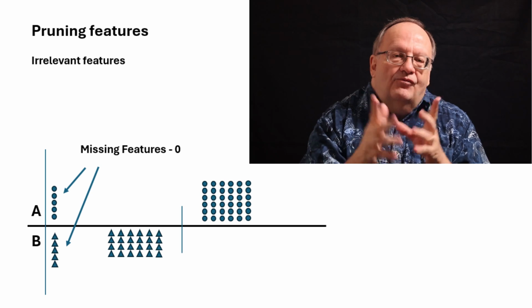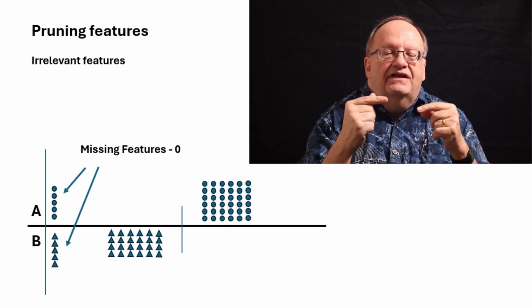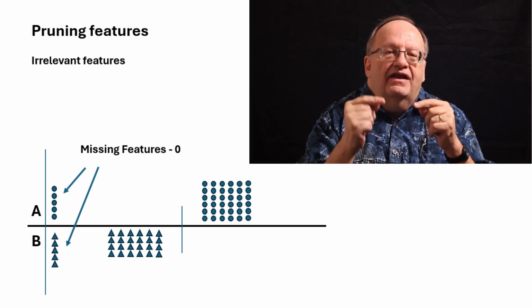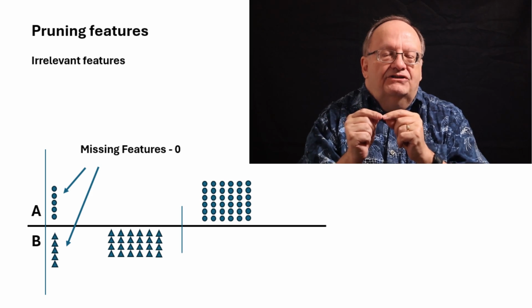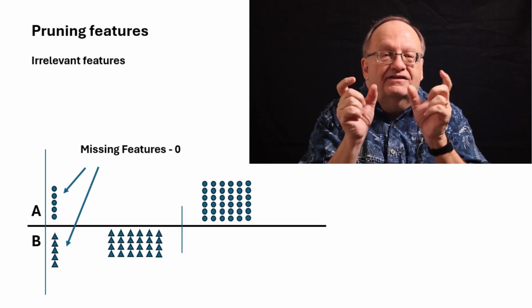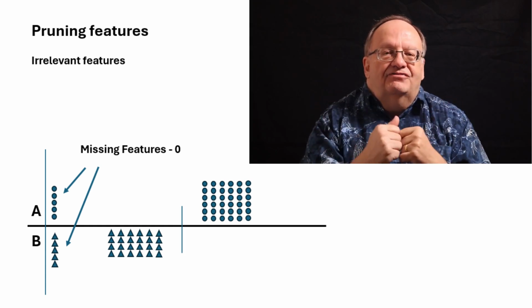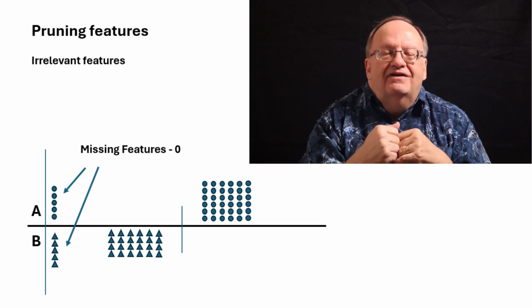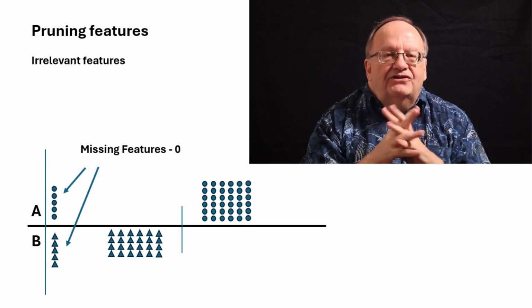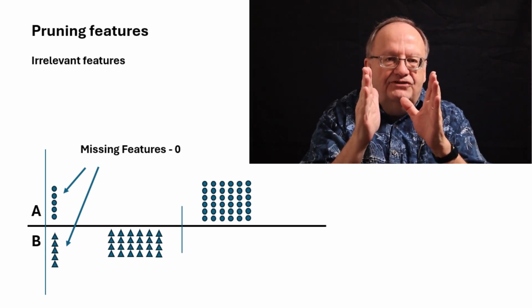So what we can recognize on this is after we've got 10 to 20 examples, we're not going to get more new features that are going to contribute to our decision. We're going to get more data that's going to help us be more careful with the features we have, but the additional features that we might discover, new spurious molecules that appear, they're not going to be helpful. So we can just forget them. And that's our first step of how to keep the number of features down.